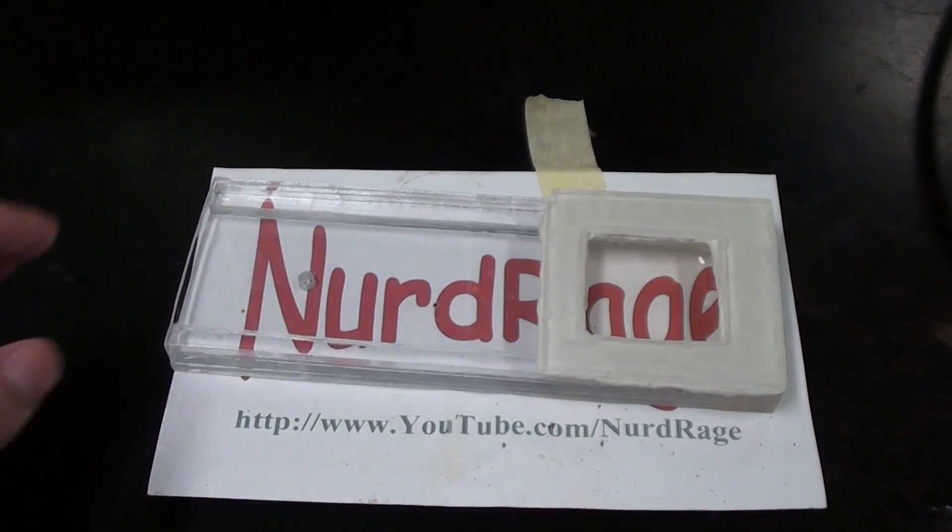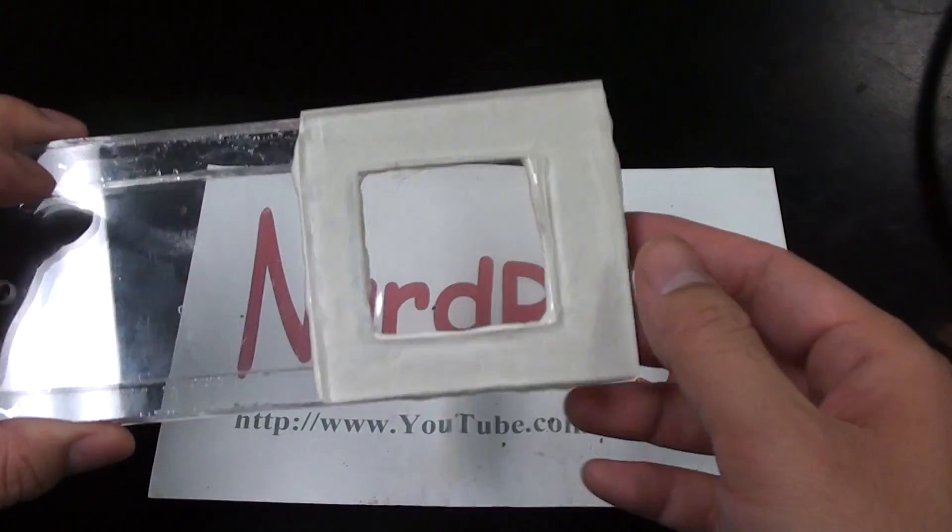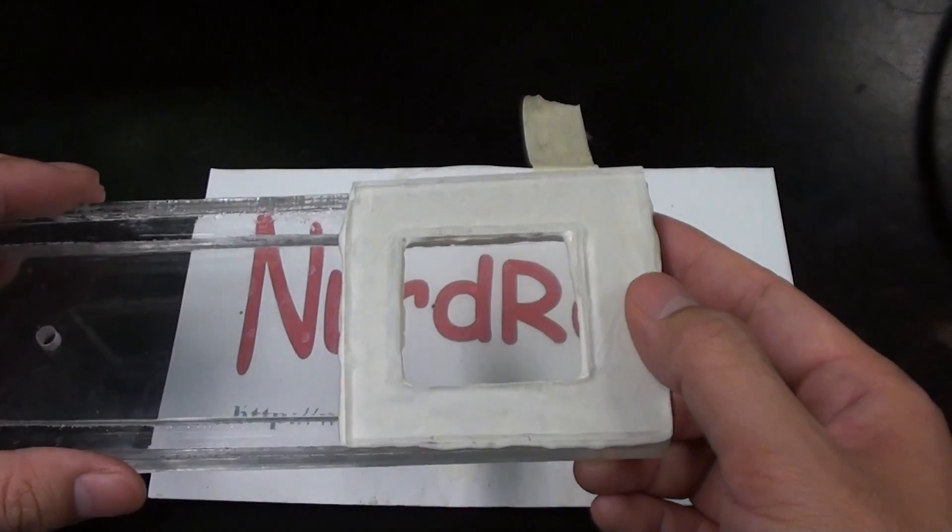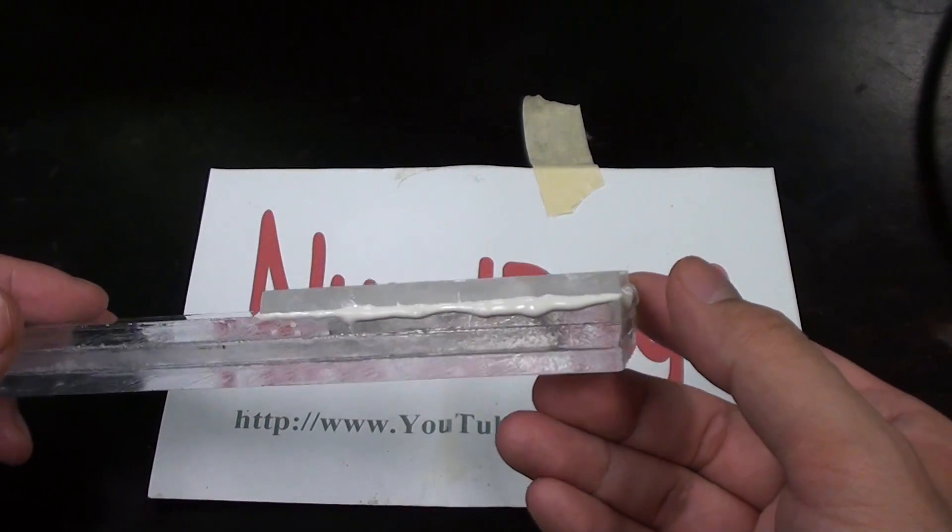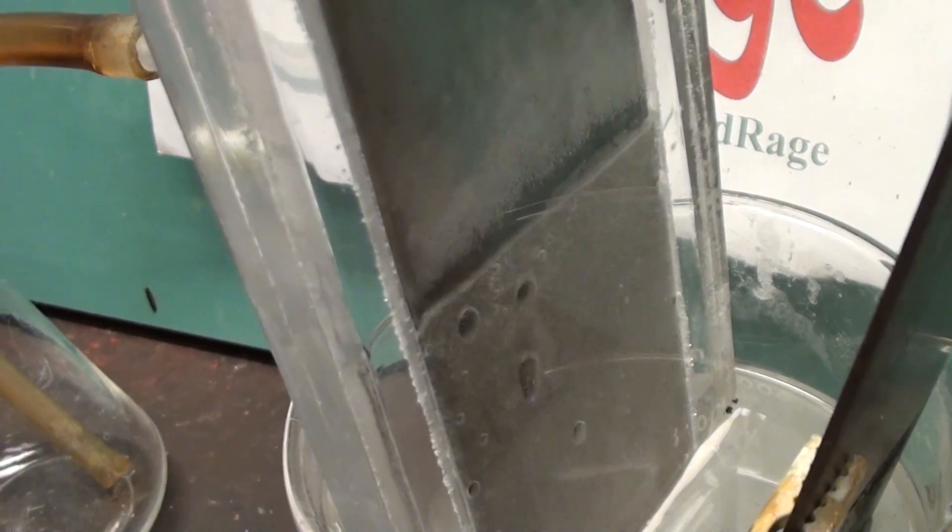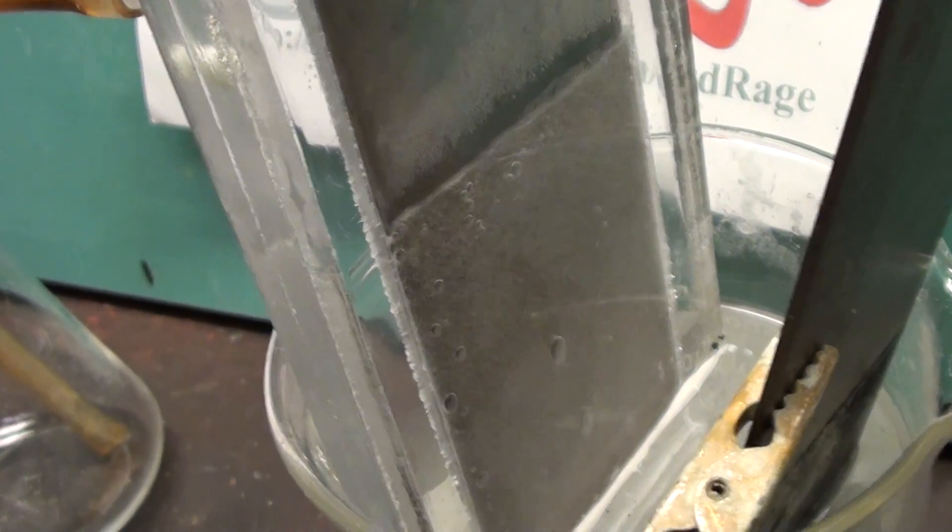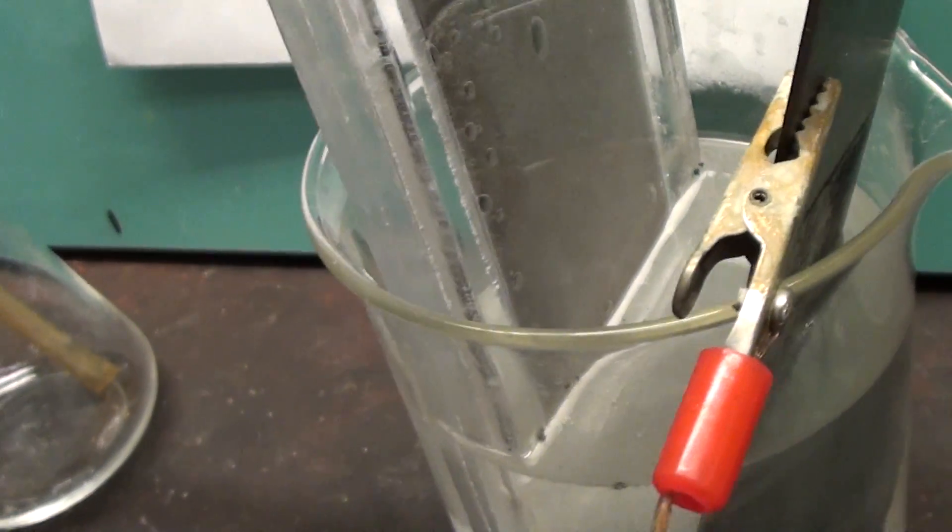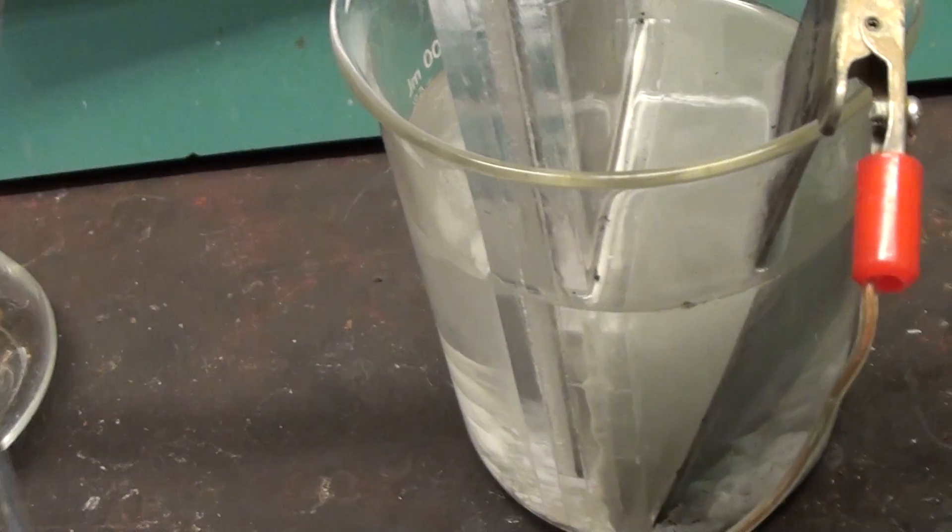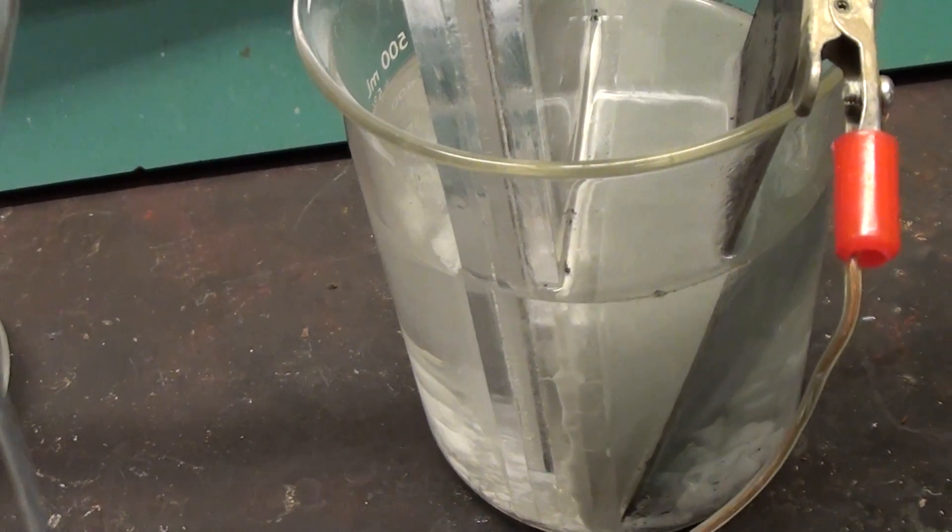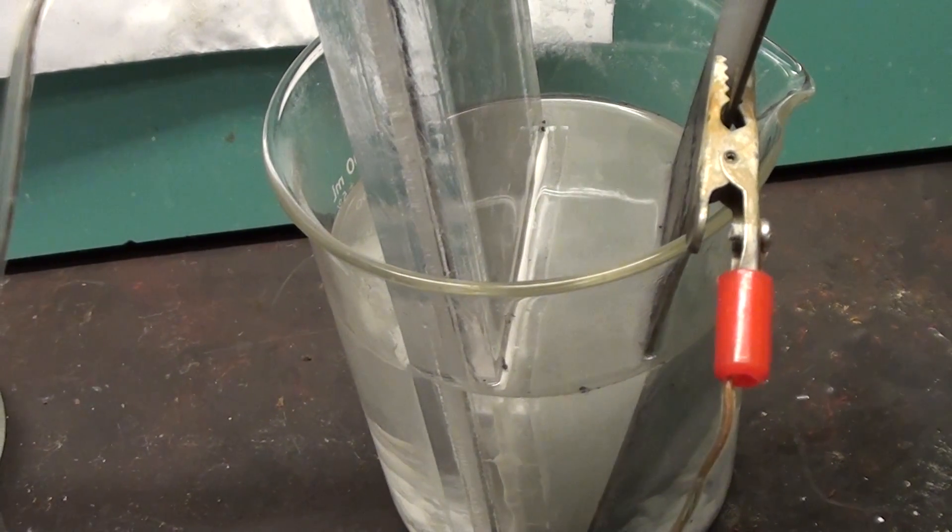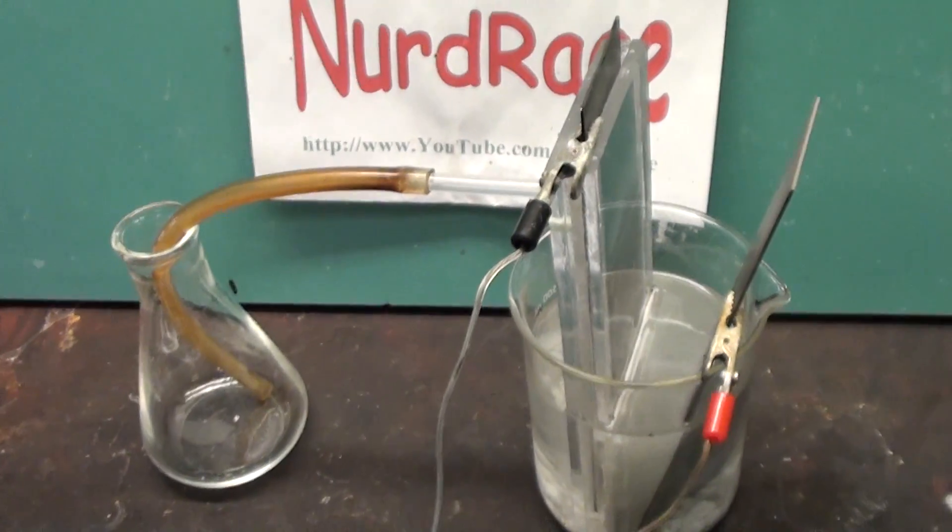And that's it, a simple Nafion membrane cell. It's pretty crude and if the membrane fails, wears out or gets punctured, we can't replace it and have to completely rebuild it. But it's easy to use and all you have to do is put the whole thing into a much larger container. And that container now serves as the second compartment of a two compartment cell. You can then load up that compartment with all kinds of chemicals and complex electrodes. And after you finish your experiment, you can just pull the membrane cell out and easily leave behind the products of the outer compartment.